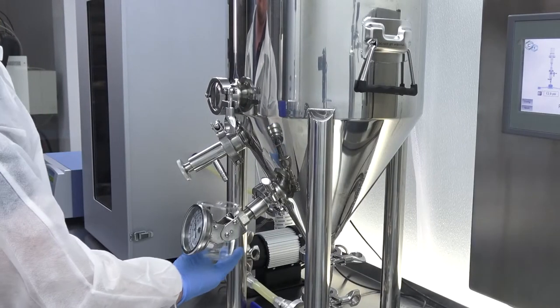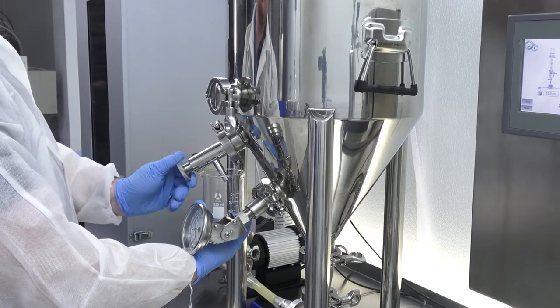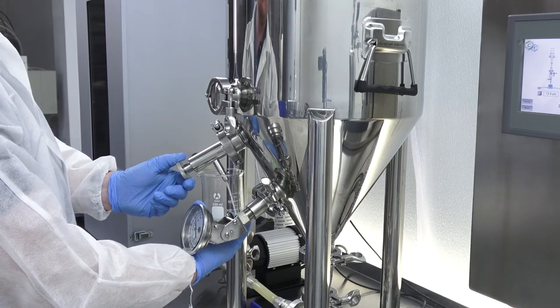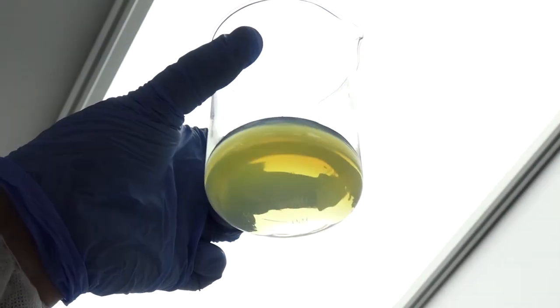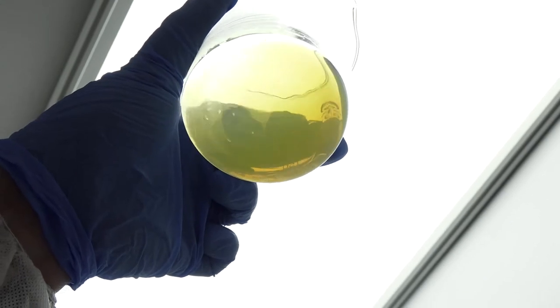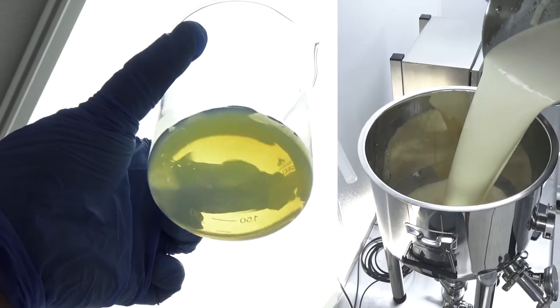At the 1 hour and 50 minute point, we take a sample of the emulsion to check for completion. Clarity is a good indicator of particle size, because particles under 100 nanometers don't scatter visible light. As you can see, the emulsion has improved in clarity dramatically compared to when we first loaded the process tank. Looks like we're just about done.